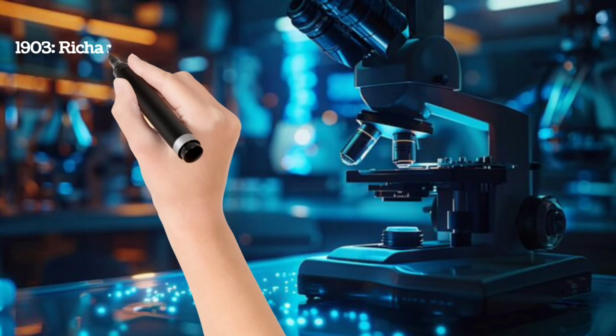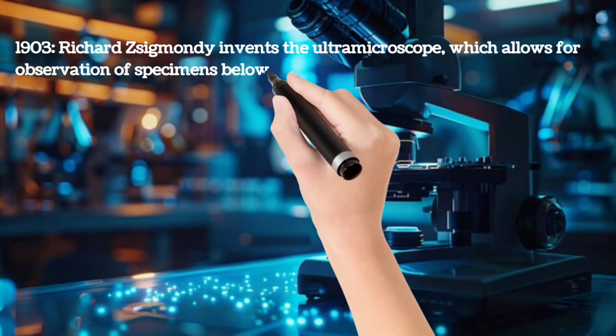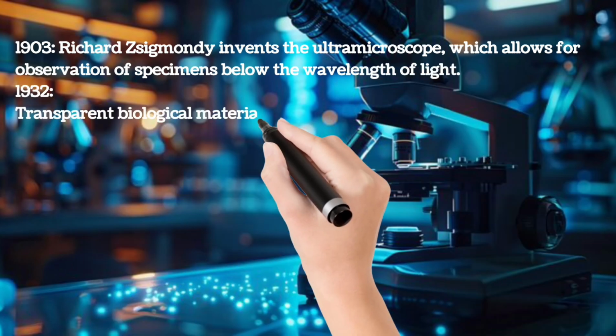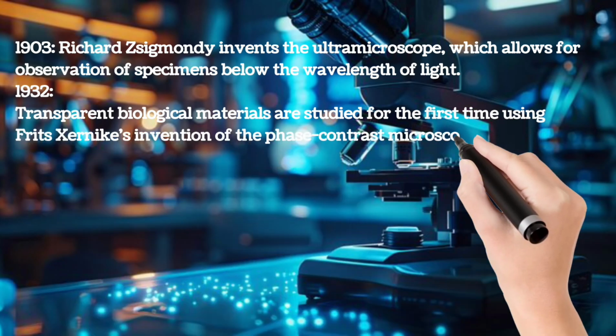In 1903, Richard Zsigmondy invents the ultramicroscope, which allows for observation of specimens below the wavelength of light. 1932: transparent biological materials are studied for the first time using Fritz Zernike's invention of the phase contrast microscope.